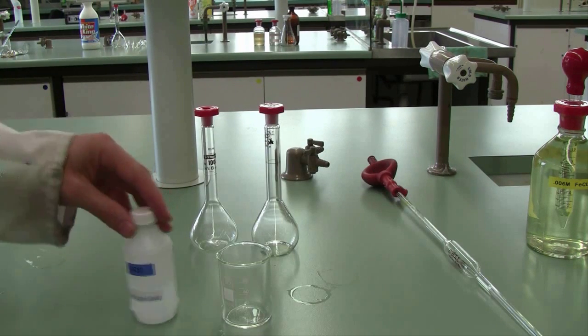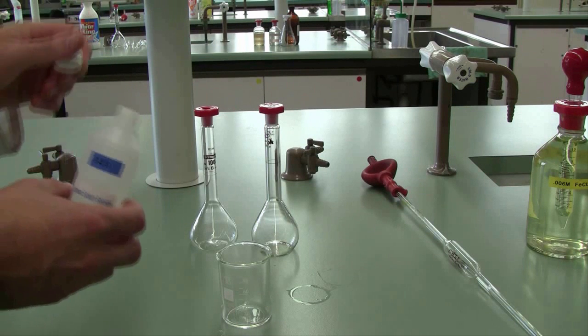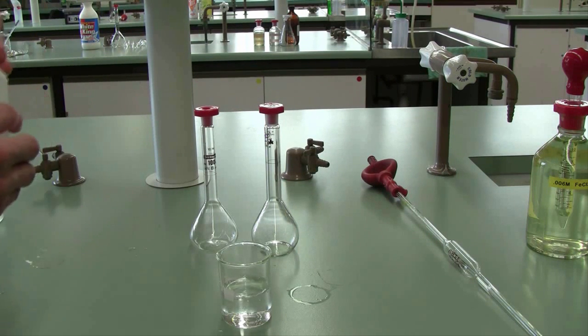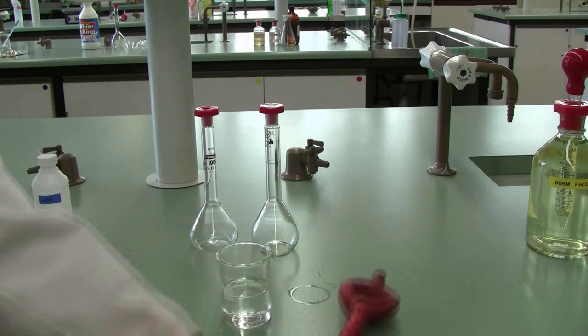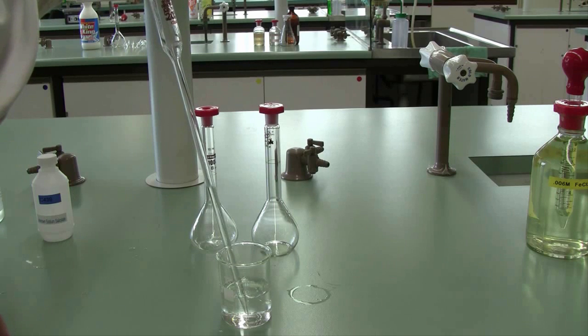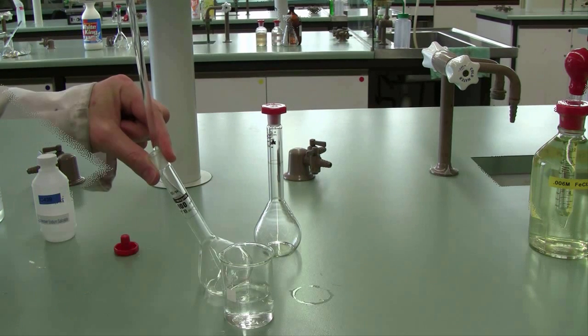Take your unknown solution and pour it into a clean dry beaker, collecting a 20 mL aliquot using your pipette and delivering it into a 100 mL standard flask. You'll complete this procedure twice so you have two identical replicates of your unknown sample. This gives you a means of testing your precision for this experiment.